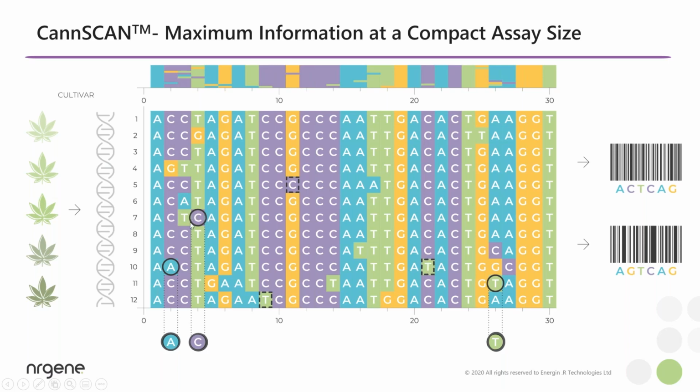If you look at these, for example, this C could discriminate between these cultivars, but also number 2, and same goes for all the ones that are encircled in a circle. So we have taken these and the most informative ones based also on genetic considerations. We chose a subset of 200 individuals, and those create a pattern. So once we determine the most informative ones, we could collect them and create a pattern that is represented here as a barcode that is unique representation of each cultivar tested.